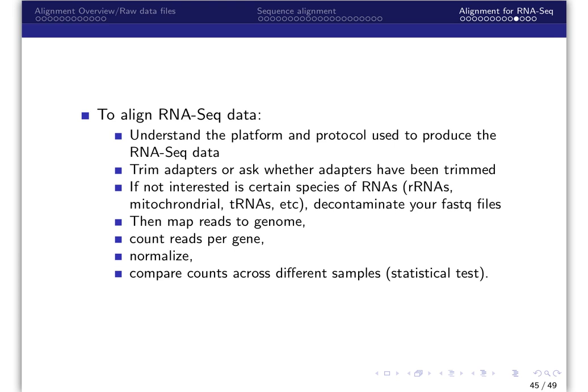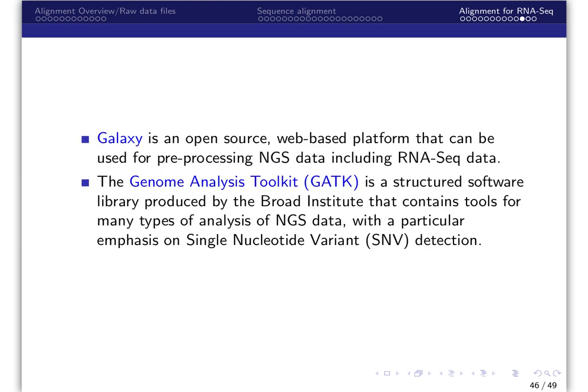Then map reads to the genome and count reads per gene and/or per exon. In upcoming modules, we will discuss normalization and statistical analysis. While we will be using R and Bioconductor packages, the methods that I have described are largely publicly available and can be run from a command line prompt, with the exception of Illumina's proprietary methods.